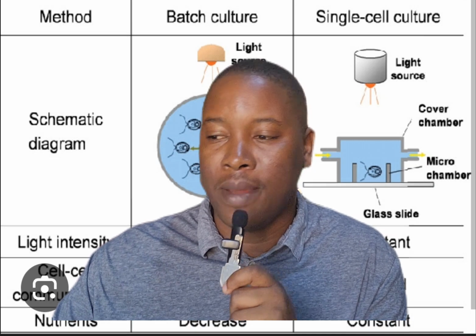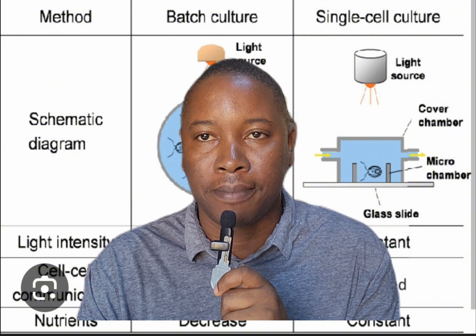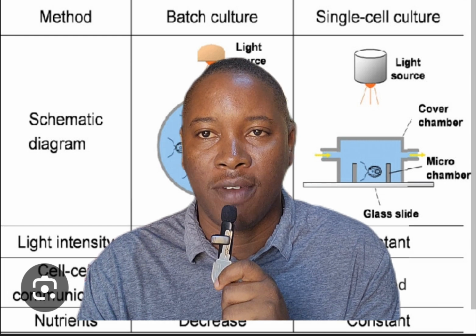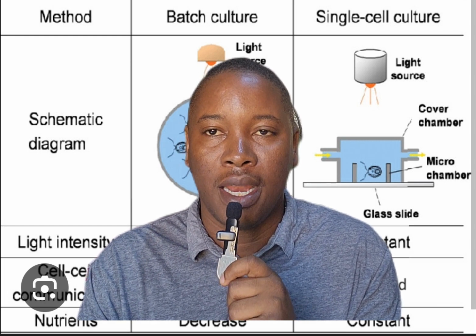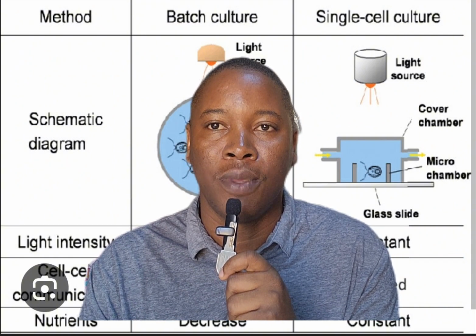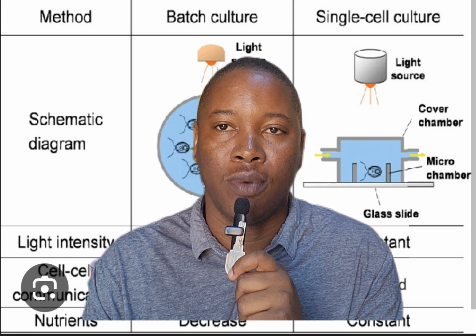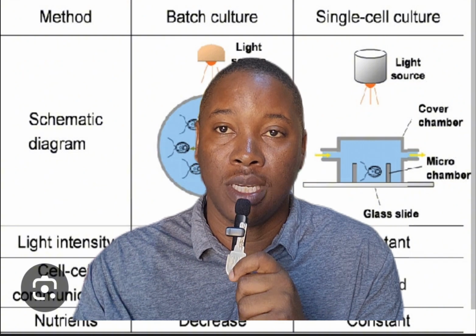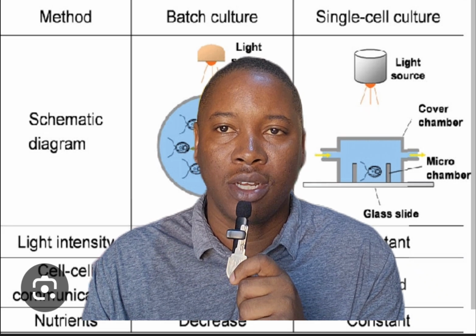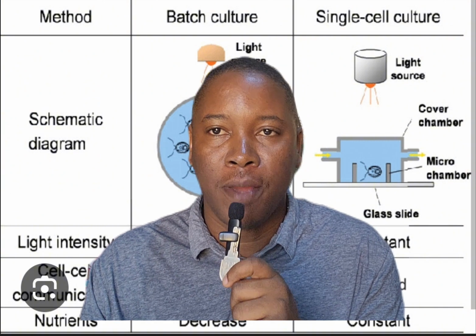Now, how do we prepare a batch culture? What are the processes that we use to prepare a batch culture? First of all, we prepare our media. Whatever media we want to use, whether it's nutrient agar, MacConkey, EMB, we prepare it. How do we prepare the media? We have measurements, we have the manufacturer's instructions. So we measure according to the manufacturer's instructions for the amount we want to prepare. Then when we've measured, we fill with distilled water to a particular level, most of the time 500 ml, and then cork very tightly and sterilize the media for a period of time.